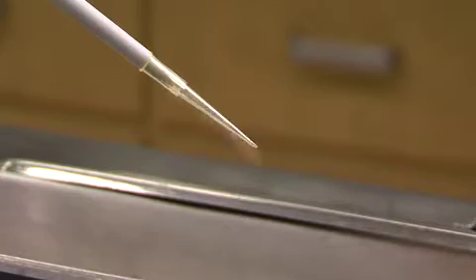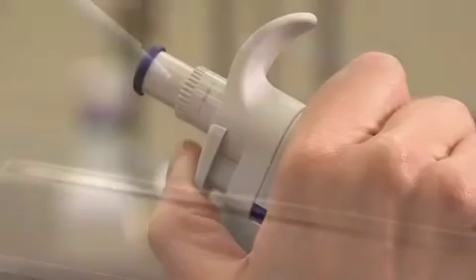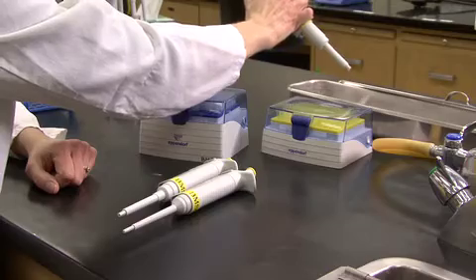Behind the plunger is an ejector button, which is used to kick off the pipette tip without requiring you to touch a potentially contaminated tip.